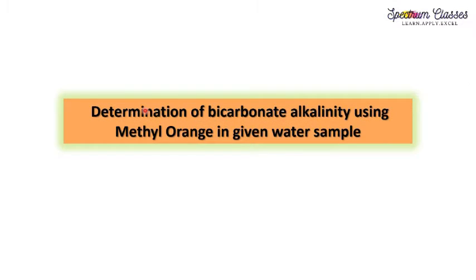In this video I am going to show one experiment: the determination of bicarbonate alkalinity using methyl orange as an indicator in a given water sample.